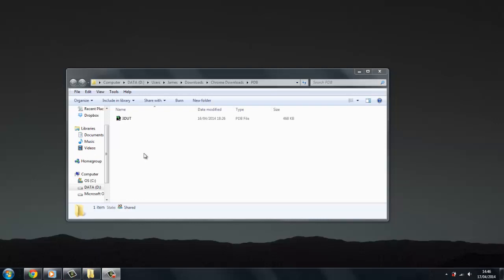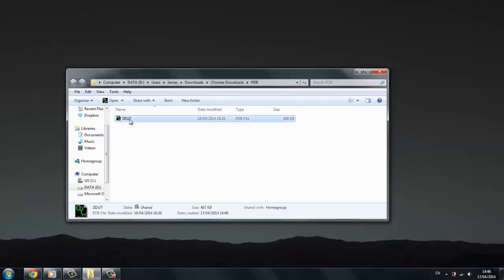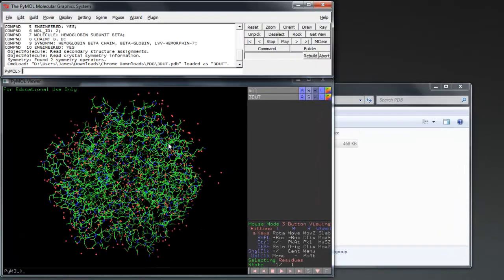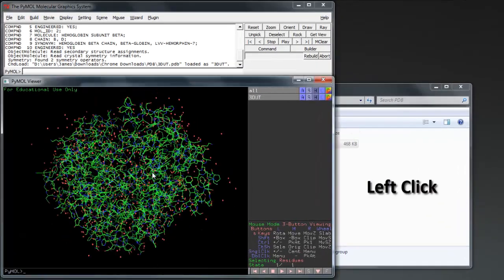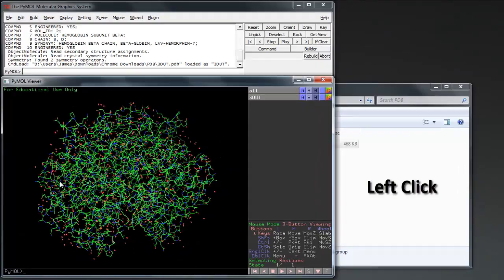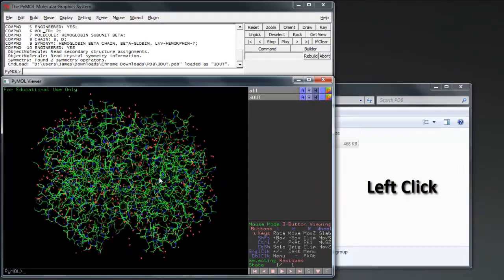We now want to open our .pdb file, in my case Human Deoxy-Hemoglobin. To manipulate the camera on our protein or object, we left-click to change perspective or rotate.